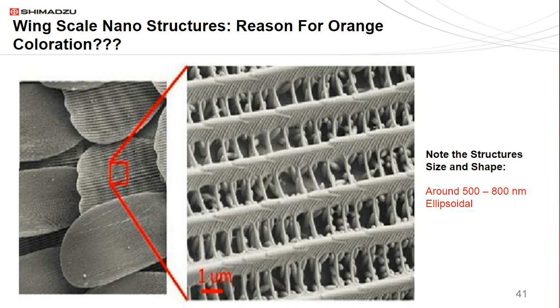And indeed, it looks like, from the photomicrographs, that these small structures are responsible for the orange coloration by diffracting the light. And you can finally see that we could easily see this in the previous spectrum. The last slide shows those 4 peak structures that are caused by these ellipsoidal nanostructures.